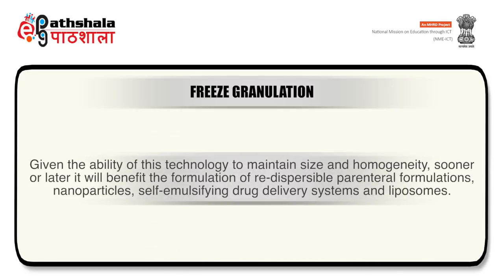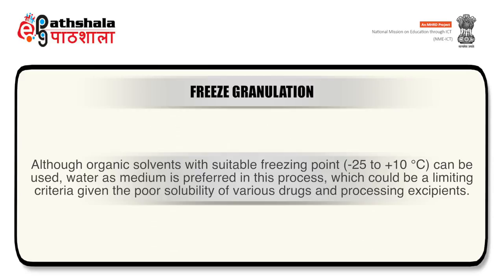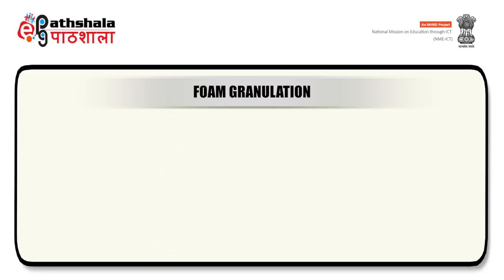Given the ability of this technology to maintain size and homogeneity, sooner or later it will benefit the formulation of redispersible parenteral formulations, nanoparticles, self-emulsifying drug delivery systems, and liposomes. Although organic solvents with suitable freezing points, that is minus 25 to plus 10 degrees Celsius, can be used, water as medium is preferred in the process, which could be a limiting criterion given the poor solubility of various drugs and processing excipients. Now let us discuss foam granulation.